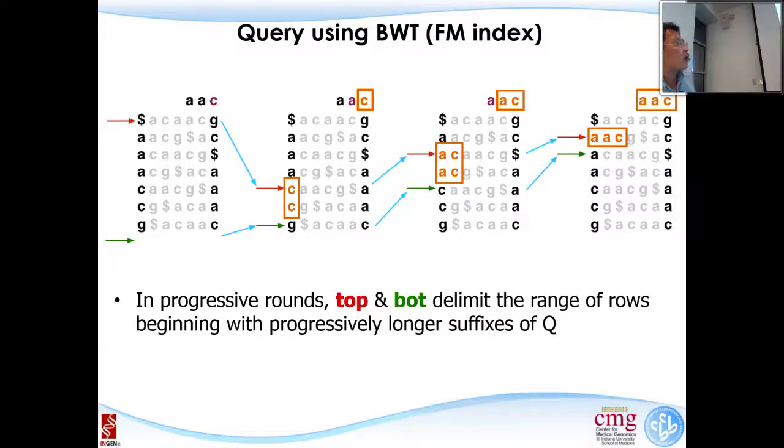I'm saying, okay, so this C is recognized, easy to recognize, and here is the second A, this is the third A, right? How do I know this is the second A, this is the third A? Well, I can count, right? So this is the first, this is the second, this is the third. But if this one has 3 billion letters, it will take a while to count it, right? So that is not the most economic way to do the calculation.